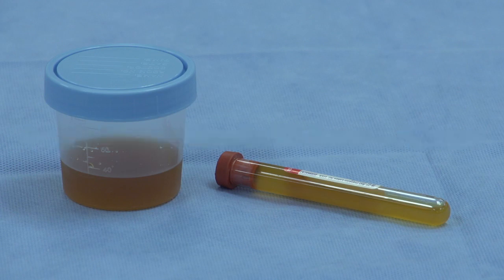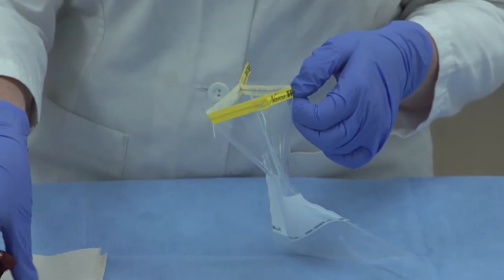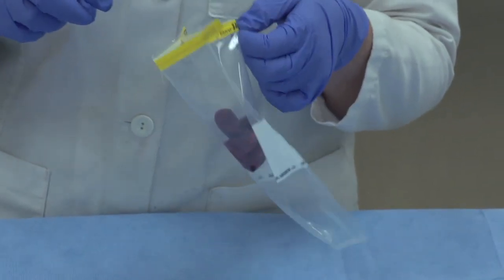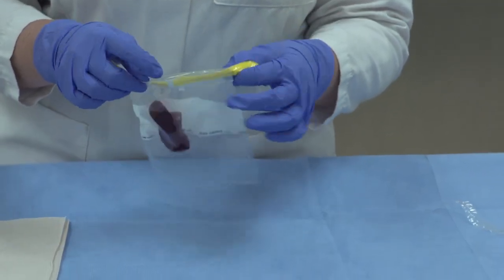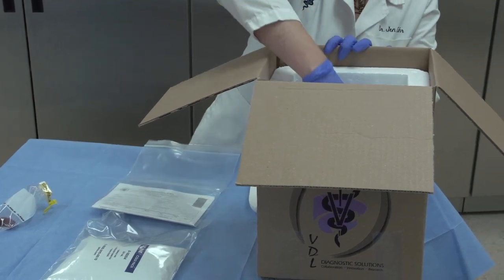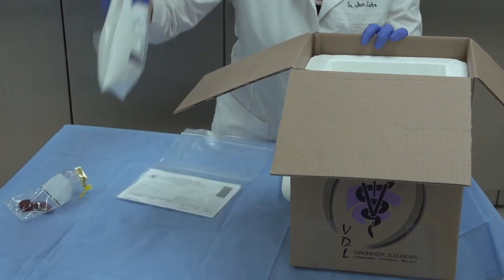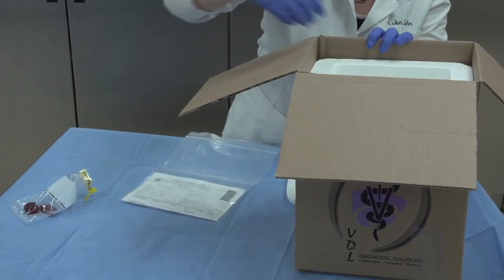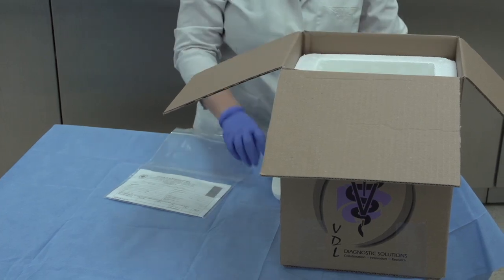These samples should be collected as cleanly as possible into clean or sterile containers. Exam gloves and OB sleeves are not appropriate containers. The primary container or swab should be placed in a baggie or Whirlpack. These samples should be protected from temperature extremes with a styrofoam cooler. Ice packs should be provided to achieve a refrigerator-like environment. Ideally, an equal volume of ice packs and tissue is used.